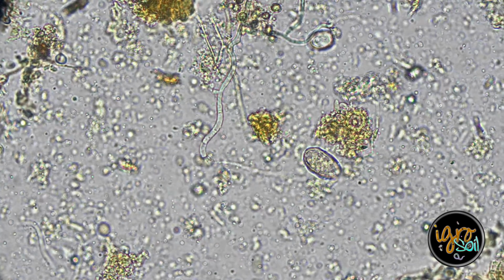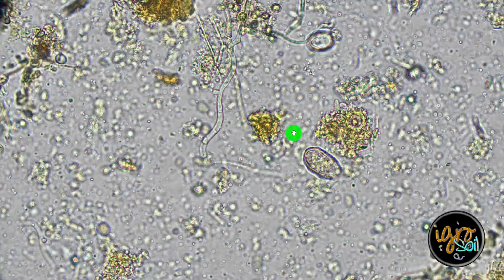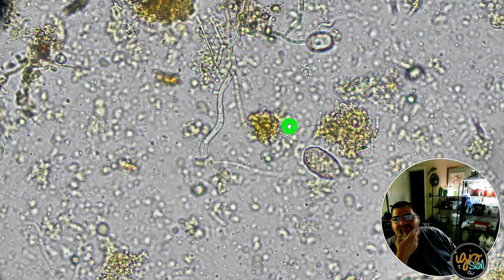If you look at these little lines here, first of all, it's clear. It's transparent. We're going to find more. These little lines are called septa. And I'm going to take my time with this video.